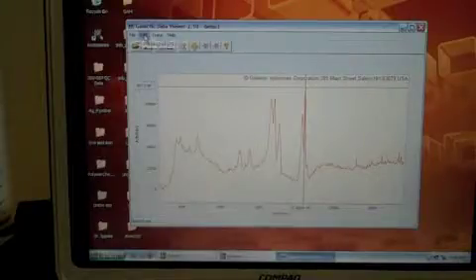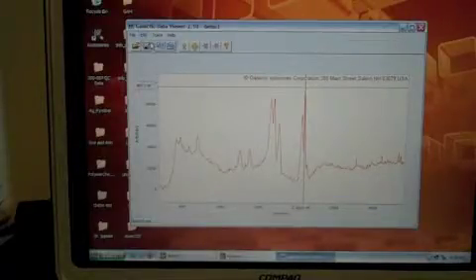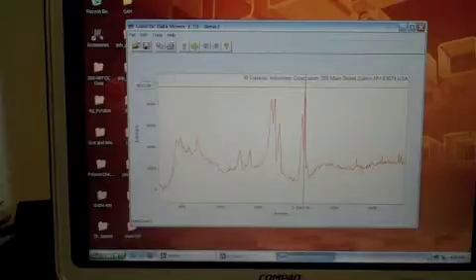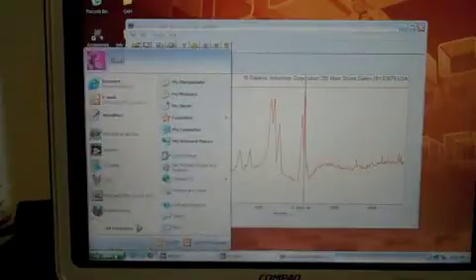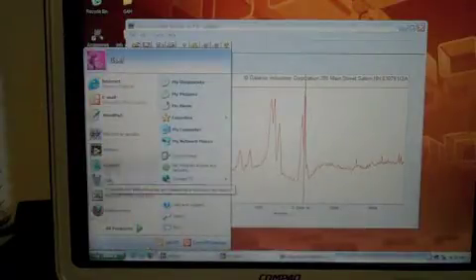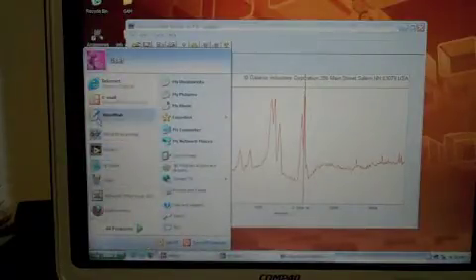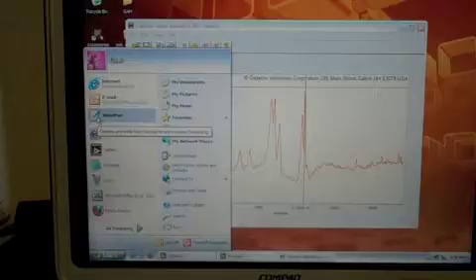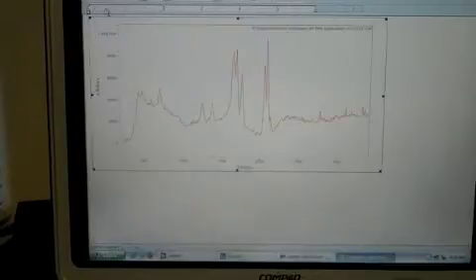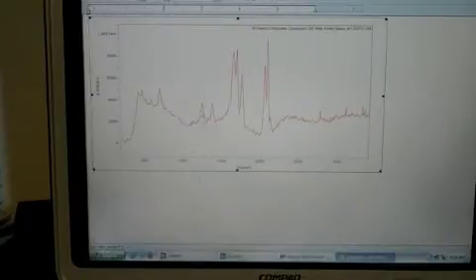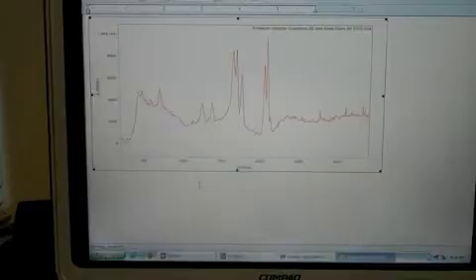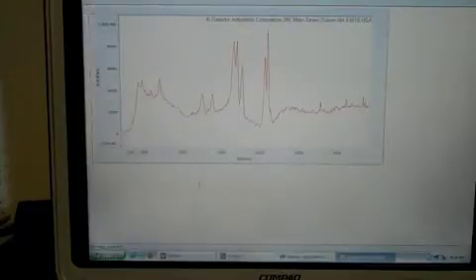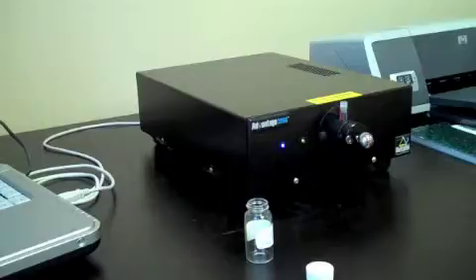When your spectrum is open in the galactic viewer, you can save it to a clipboard and paste the spectrum into a file that Microsoft Word can open. Open the WordPad program. You can treat this as a Microsoft Word file. Paste the spectrum into the page in WordPad. You can open this folder and splice the spectra into your report or print them out for your notebook. Please note that you will not be able to read precisely the peak positions nor intensities while in this format.